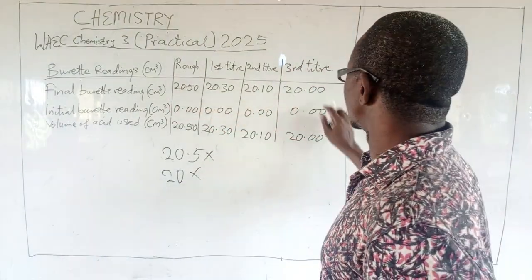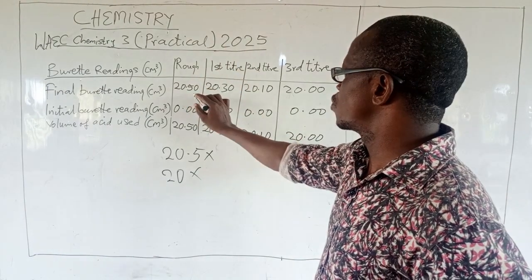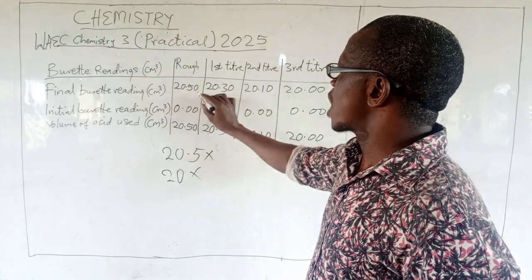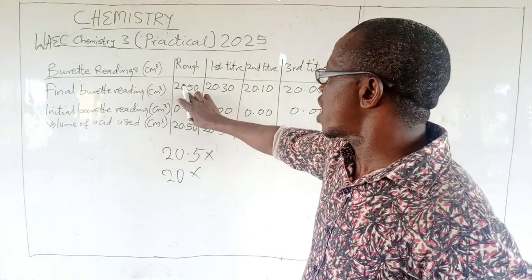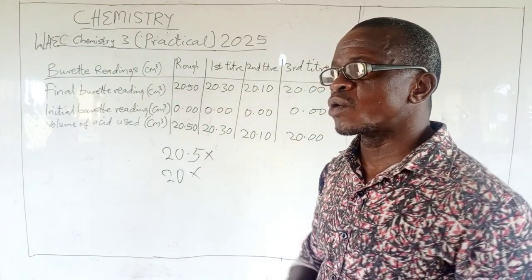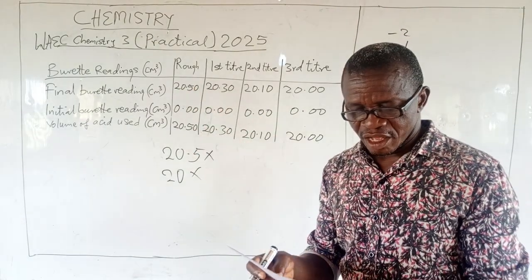Make sure that all the values in the table are in two decimal places. Once you fix the decimal point, you should have two values there. If it is 0.5, do not end it with 0.5. Put what? 0 in addition. That's two decimal places.